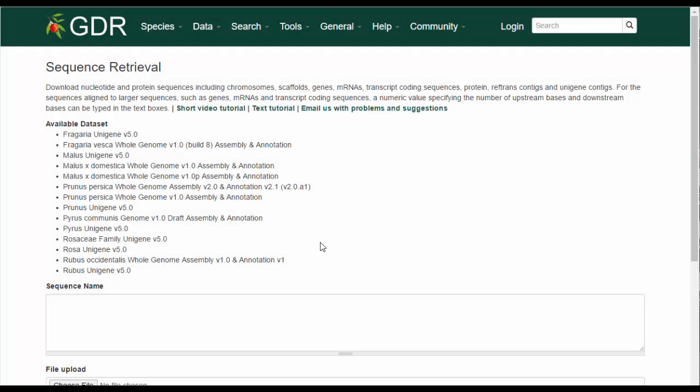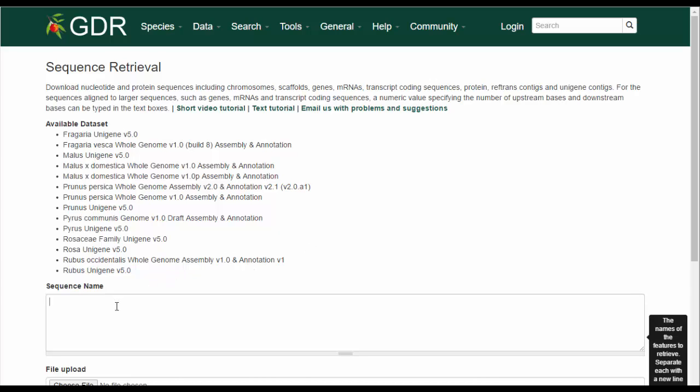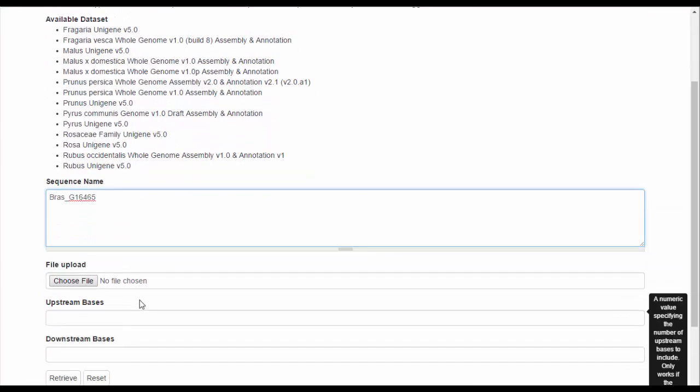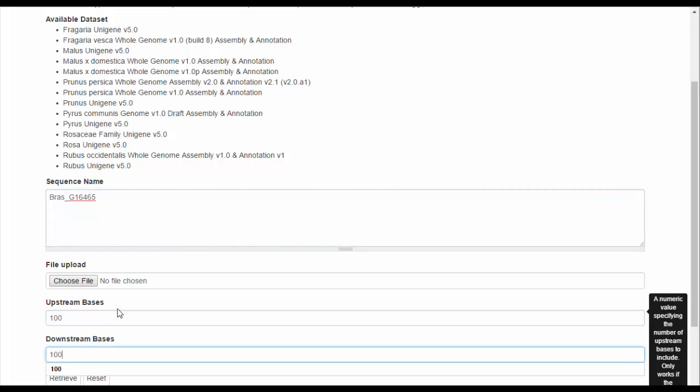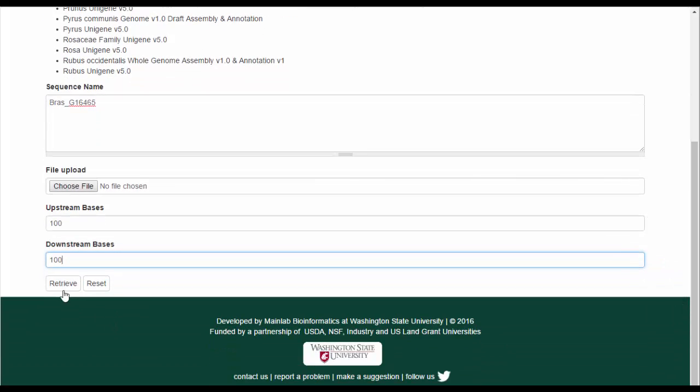Here are a couple examples of how to use this tool. To download a gene sequence that is mapped on a genome, type in the sequence name, or upload a text file with multiple names and enter the number of base pairs up and downstream that you would like to retrieve in addition to the gene. And then click Retrieve.